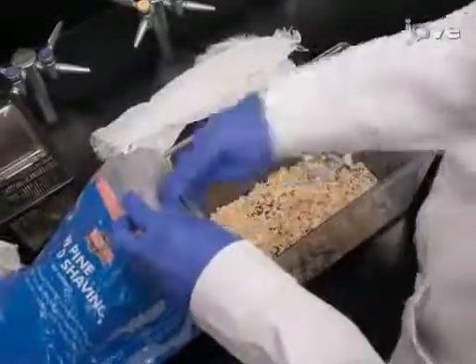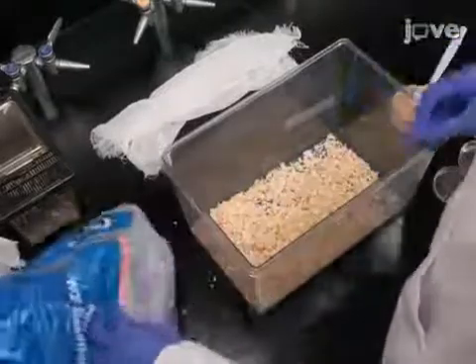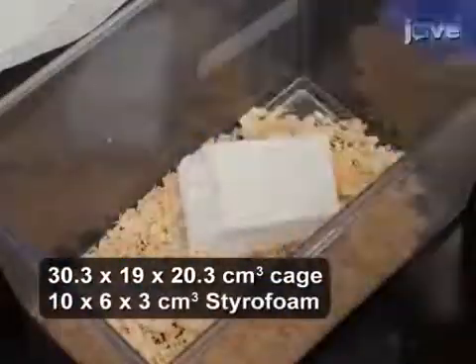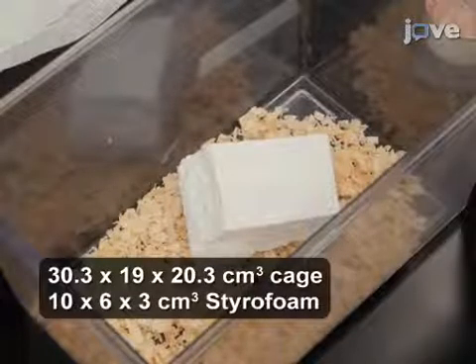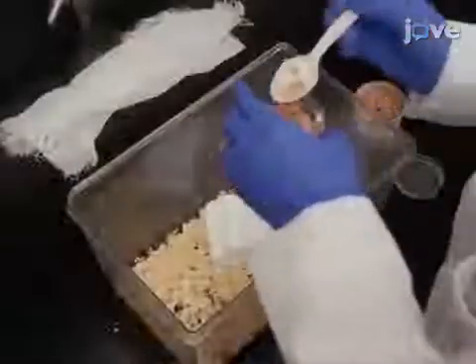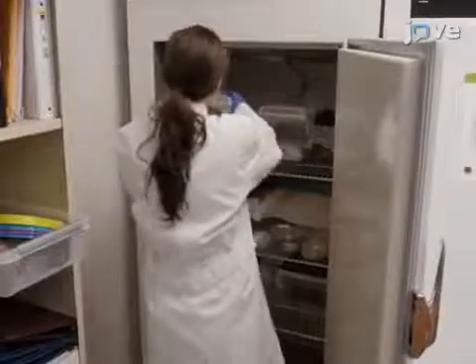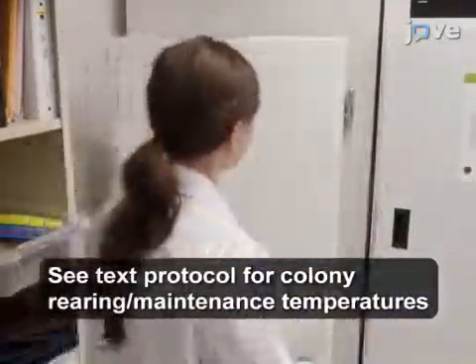To prepare a rearing cage for D. maculatus, first spread a thin layer of wood shavings into a medium-sized insect cage. Place a section of styrofoam into the cage to allow larvae an environment in which to pupate. Add 20 to 50 adult beetles or late instar larvae to the cage. Place wet cat food into a petri dish or weigh boat as a food source. Cover the cage with a mesh cloth and place it into an incubator.